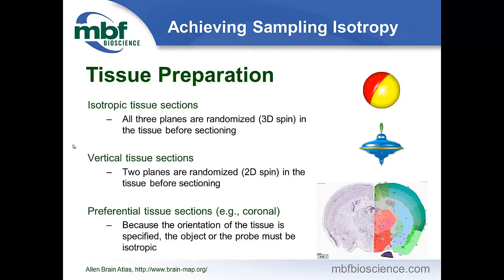Sure. You can imagine an isotropic feature in, like, a marble. So a marble is perfectly spherical. You can imagine that no matter how that marble is presented, so that jar of marbles we showed at the beginning, the distribution of those marbles would be isotropic. But take an organ like the brain. If you're talking about the organization of axons, in order to be isotropic, that axon would have to, on average, come right back to the cell body. And that's not the way the brain is organized. And so most of the features we're looking at in biology, you can't assume that they're isotropic.